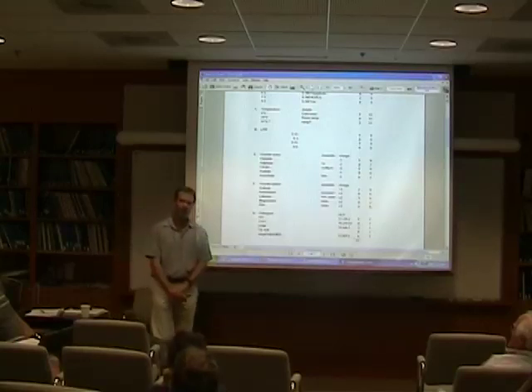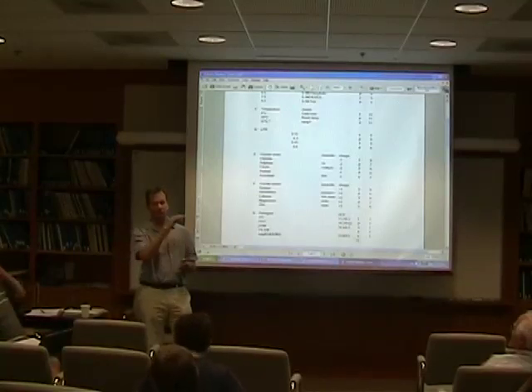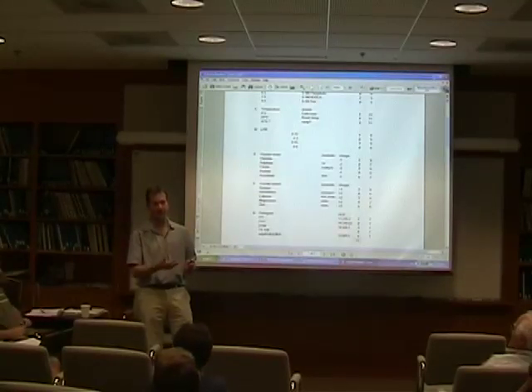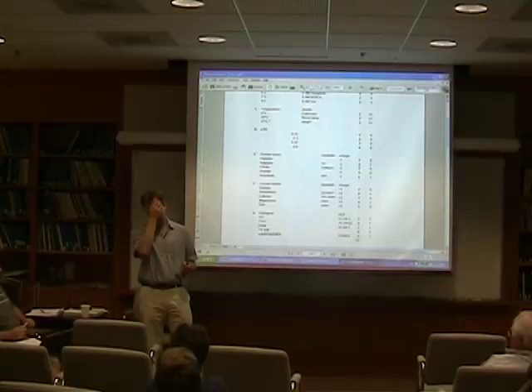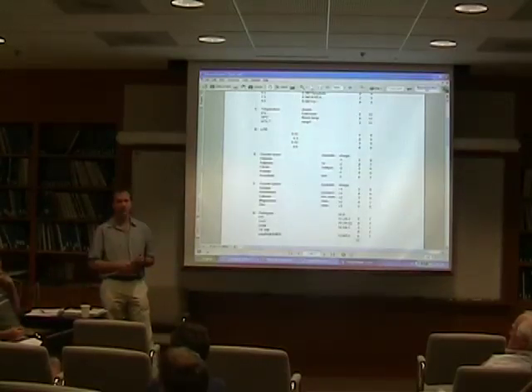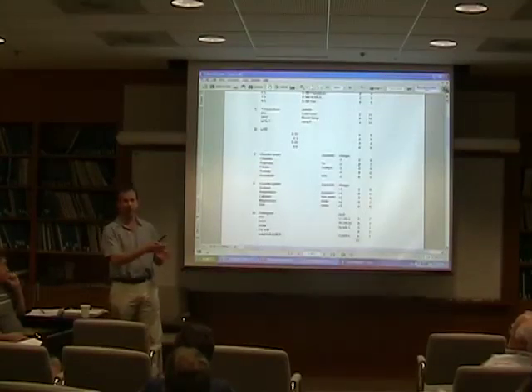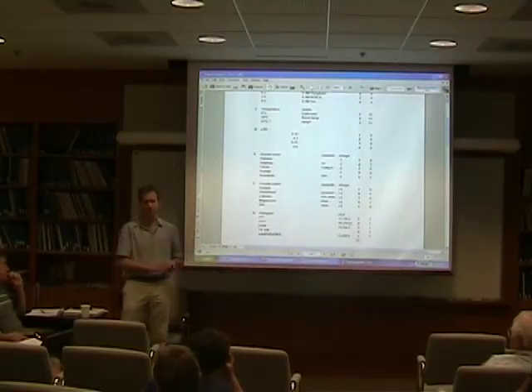Well, that's the trouble when you do a first screen: we don't know, so we have to generate it randomly and see what comes up, and then have a look at those things individually and see whether they're likely to work or not. It's a complete, useless trial, and then you have to do that. On the other hand, you could say we're going to put it in anyway, leave it as it is, and say, well, clearly these are bad conditions because they mixed together, they interact in a bad way, and we don't want that.